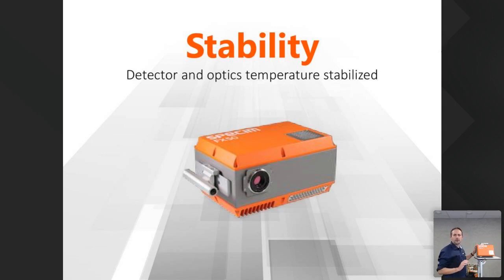The detector, of course, is an InSb, which is cooled down to about 80 Kelvin with a Stirling cooler. But the optics in there is stabilized at 20 degrees centigrade, 20 Celsius. Here, it is always the same.